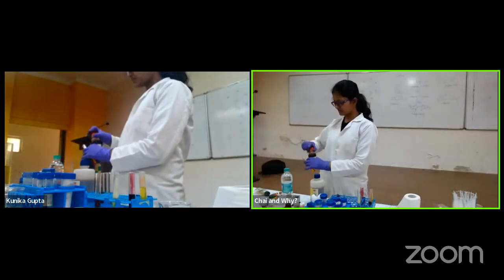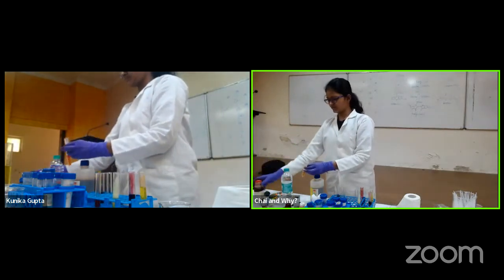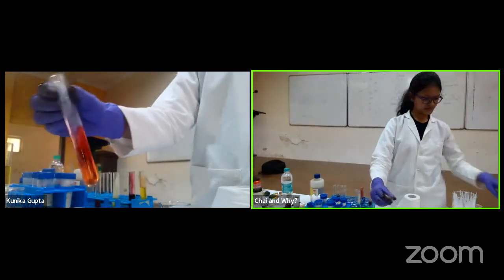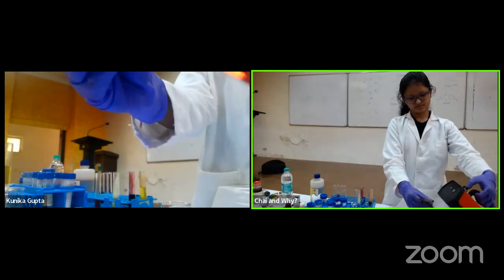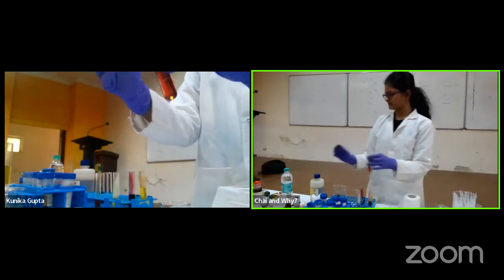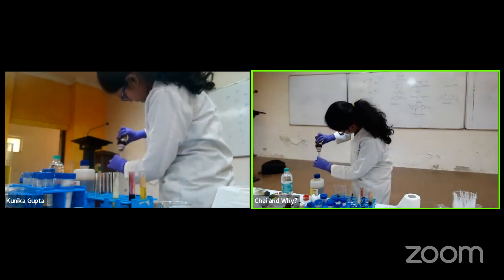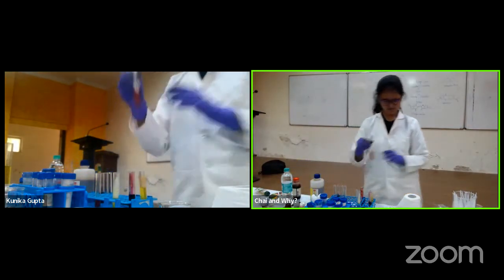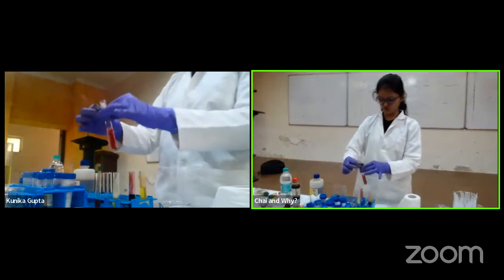Yes. Now I'll add an acid to it. I am adding it with the fumes a little towards the back. Okay, you can see some fumes coming because again it's an acid-base reaction. Let us see if this is. See it. There is something happening. I have to dilute it to show you.